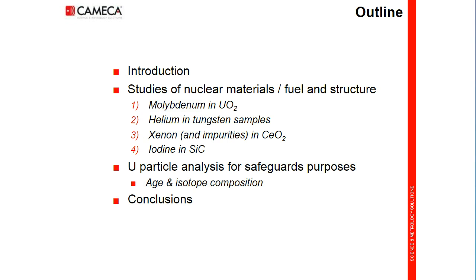Before concluding, I will show another important application in the nuclear field, which is the characterization of nuclear particles collected in nuclear facilities for the control of nuclear activities.